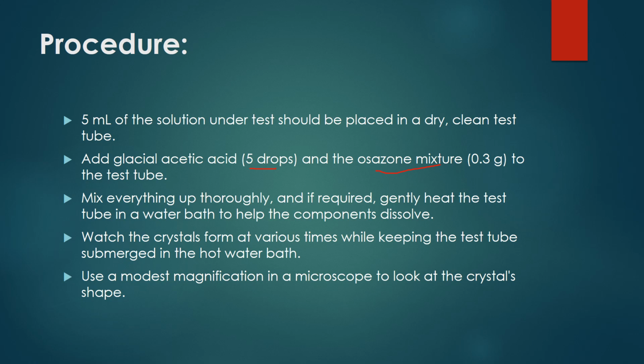Then mix everything up thoroughly, and if required, gently heat the test tube in a water bath to help the components dissolve.